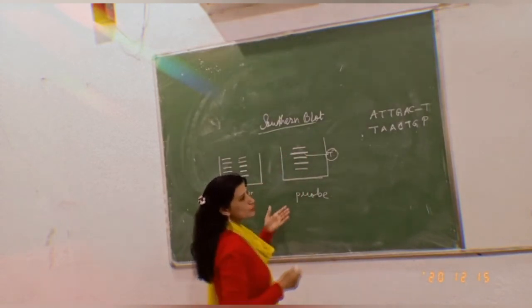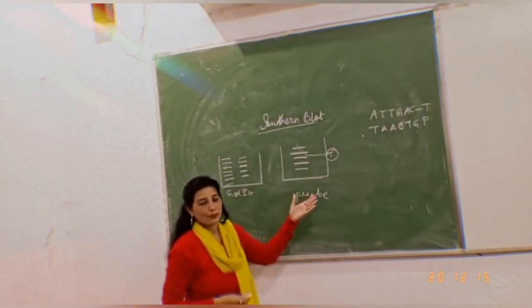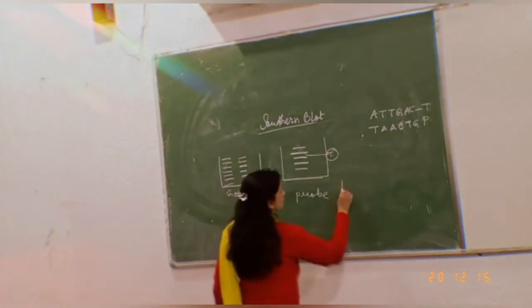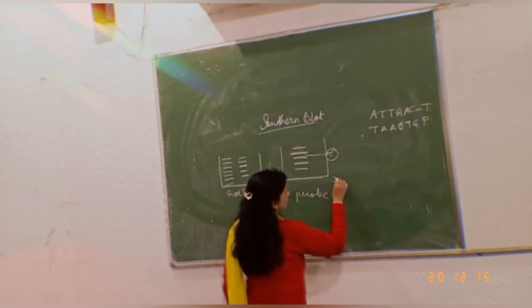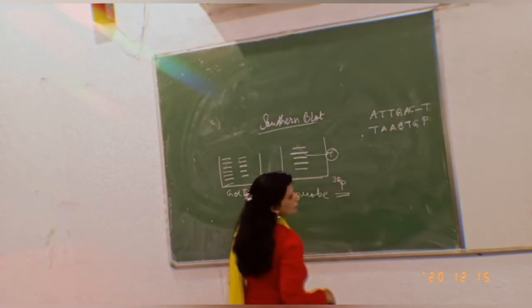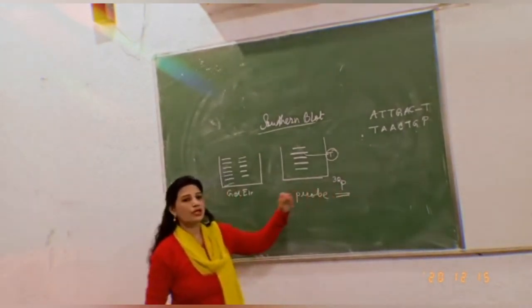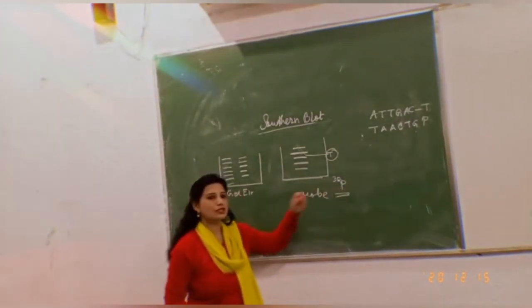Now here, if I am exposing it to UV rays, I can get it. It will locate. I'll be using P32. This is a radioactive isotope. I'll be using phosphorus 32, because it is also present in the DNA molecule.